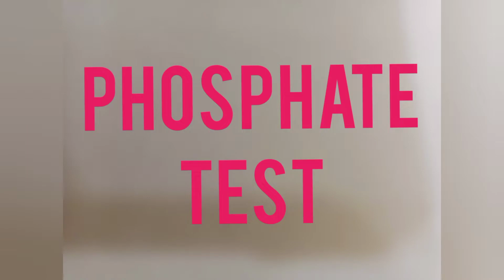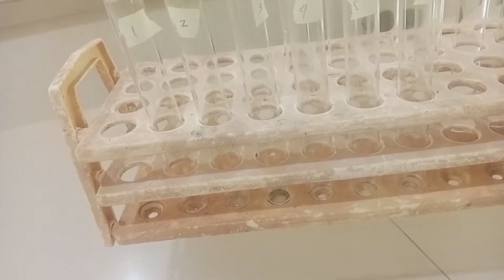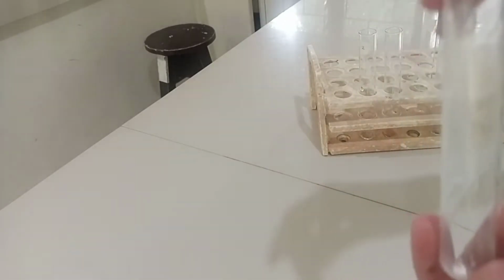For our procedures, first, take 6 clean and dry test tubes, label them, and add about 0.2 ml of sample to each test tube. Use 6 samples, one for each test tube.